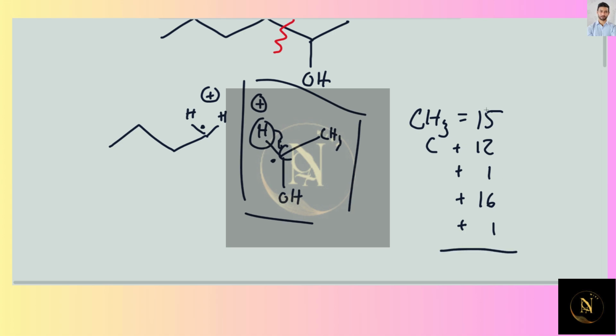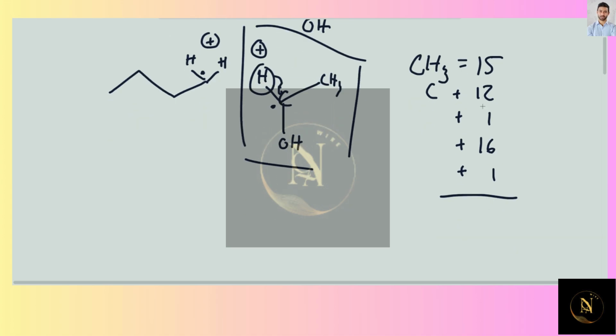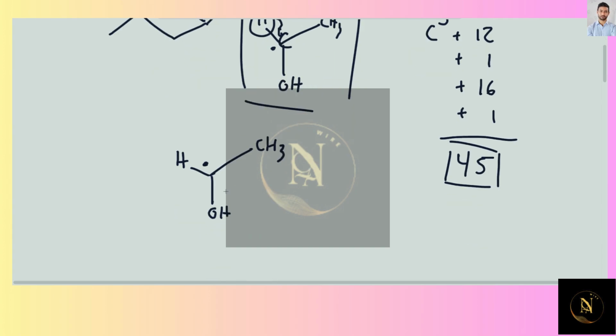So I see 45. And that's what we were looking for. We were looking for 45. So the fragment is then that, and that is 45.